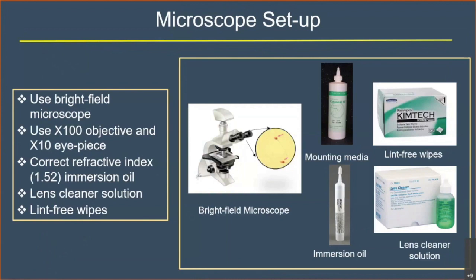For the microscope setup, we use a bright field, a 100x objective and a 10x eyepiece. We also use the immersion oil for clear visibility of the stained slide. Next slide.